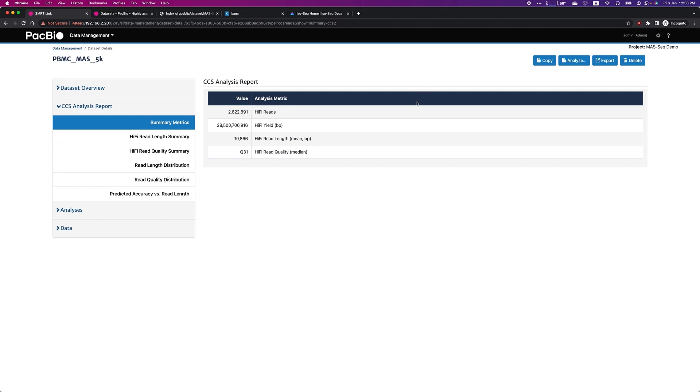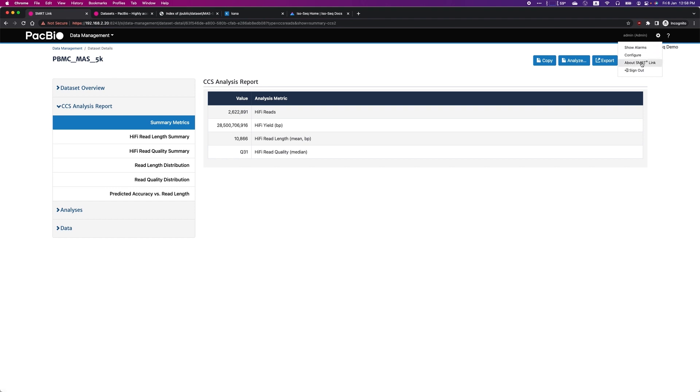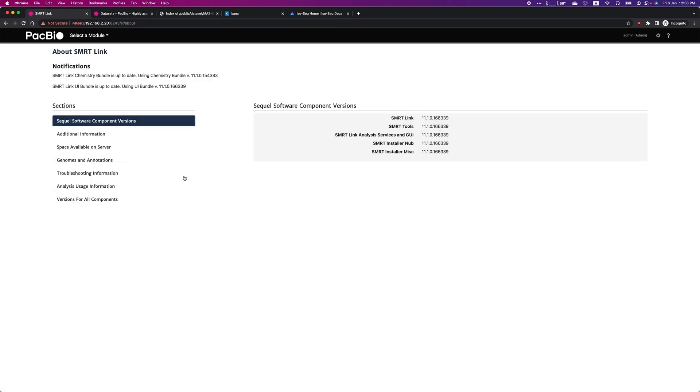Next, you will need to download the reference genome and annotation database for single-cell isoform analysis. Go to the top right corner, click on the gear icon, and select About SmartLink.